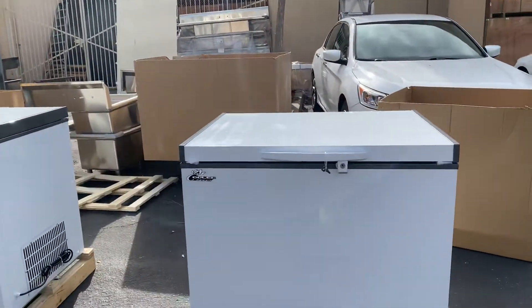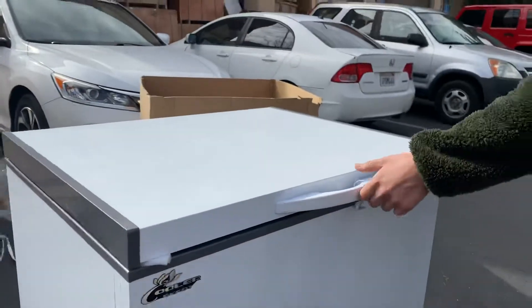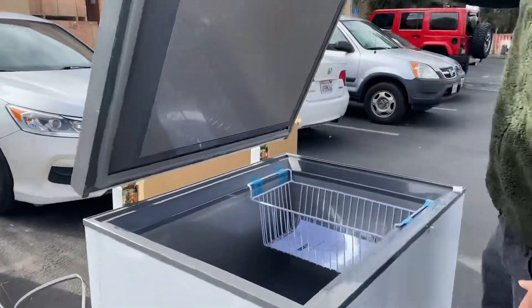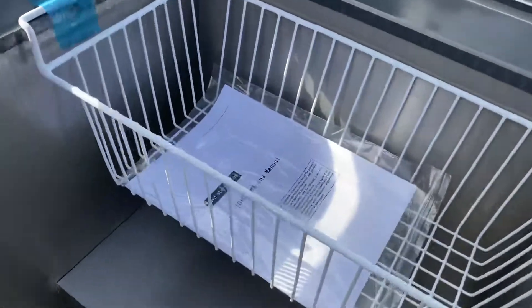The unit also has wheels on the bottom, and a handle here for the door with a key, so you do have a lock — you can go ahead and lock this door. You will be provided with the key.